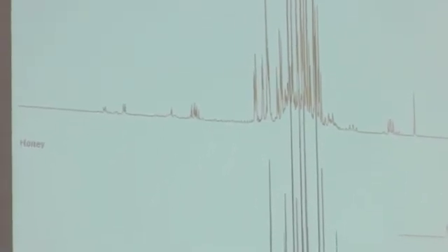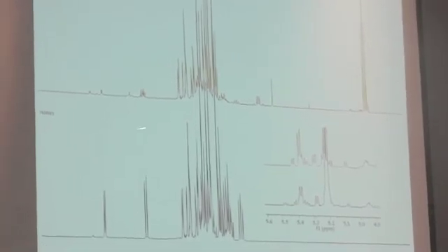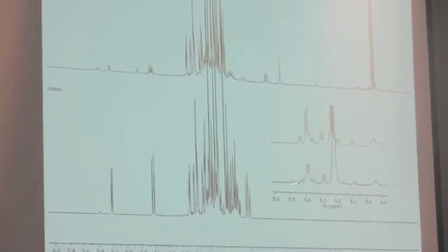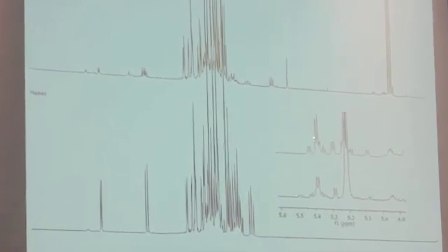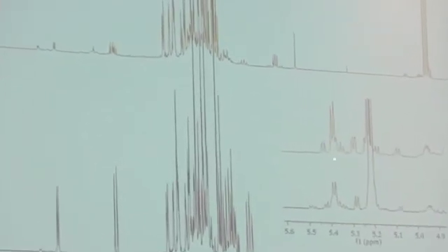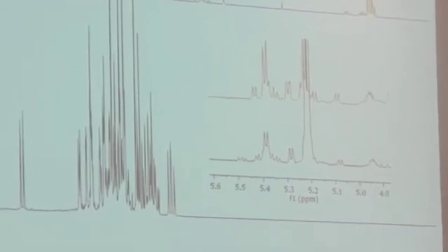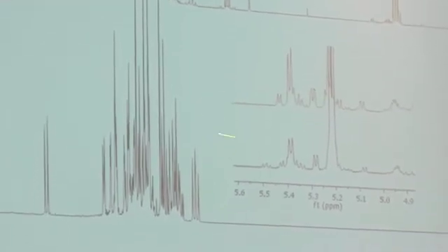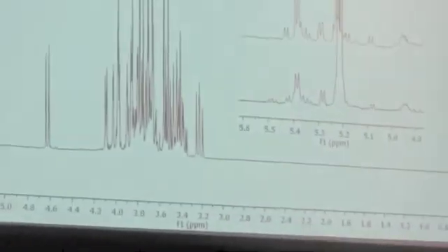So I know ciders and meads are kind of really tricky to study, so this might be a way of studying what's going on. You can see that if you took a honey, and you take what's left here, this is the honey with glucose going out the roof, but this is what's left in that cider. All this lines up, but how much of each of these peaks is in there really varies with wildflower versus clover versus what kind of bee. So for things like this, you really can do a terroir from it and say, it's from this kind of stuff.